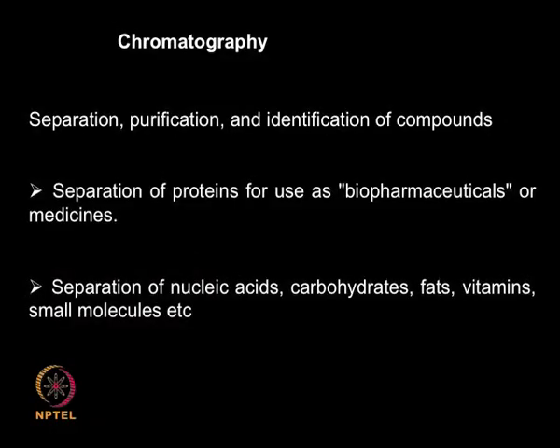So we use chromatography for separation, purification, even for identification of compounds. We can use, say, high performance chromatography for identifying some unknown metabolites. So chromatography is used in biopharmaceuticals or in medicine, chemistry, for separating proteins, nucleic acids, carbohydrates, fats, vitamins, small molecules, and so on.